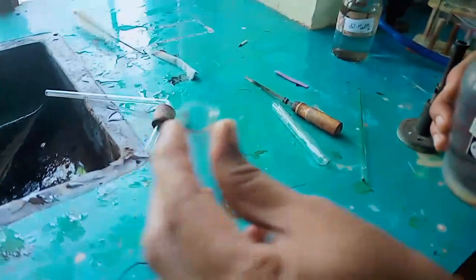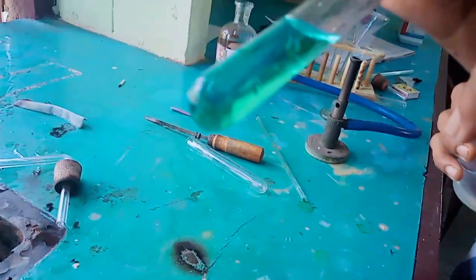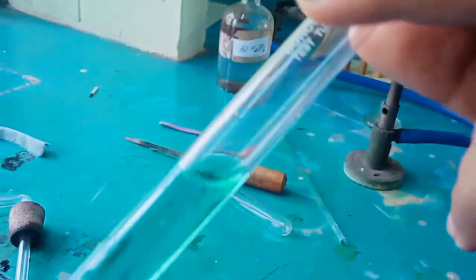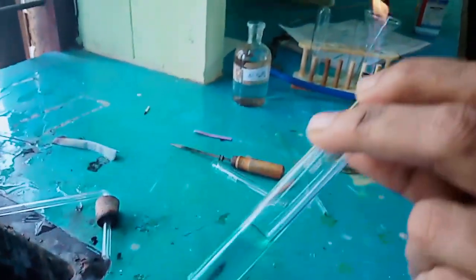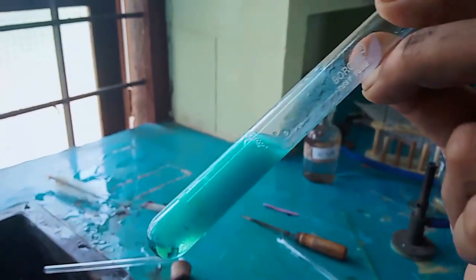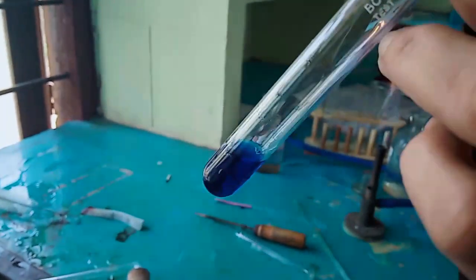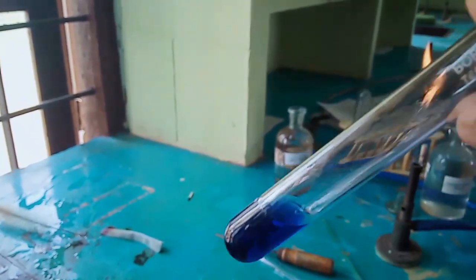Another test for ammonia is when ammonia is passed through copper sulfate solution, a blue colored solution. On passing ammonia vapor through copper sulfate solution, we can see a pale blue precipitate. On passing excess ammonia gas through the same solution, we get a deep blue coloration.